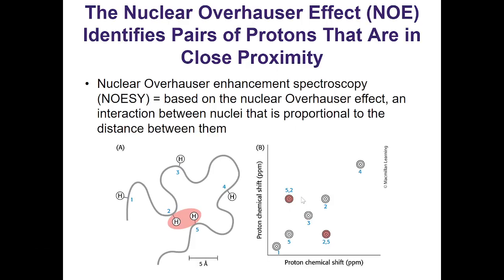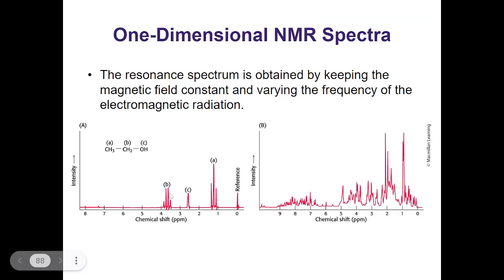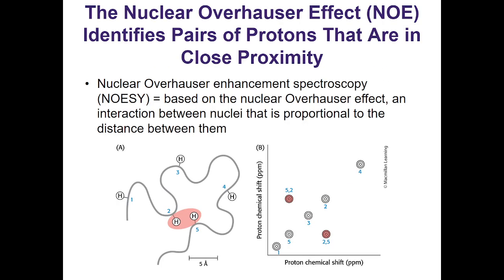And how they correspond here, these chemical shifts here, is going to tell us how far away those two groups are from each other, because they will affect each other's chemical shift depending on their proximity. You've actually seen this to some degree in this right here. If they're very close together, they affect each other's chemical shift by that little tiny amount, right? We're just looking at it by using two different ones, so we're getting a greater effect from it. Okay? Ta-da! Isn't that cool?